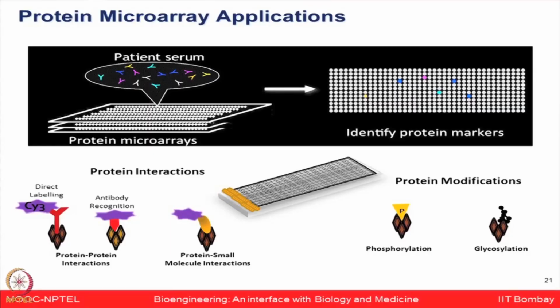Coming back to the protein microarrays. Protein microarrays have been used for many applications, especially identifying protein biomarkers, doing protein-protein interaction studies, and protein modifications like phosphorylation, glycosylation, acetylation, etc.